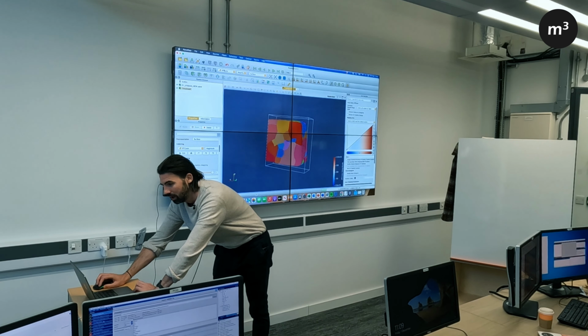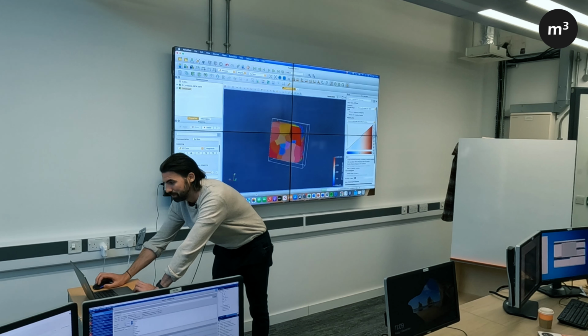What else do I want to show you? Phases is boring. MAD. Yeah, there's not that much to see on this basic data set.